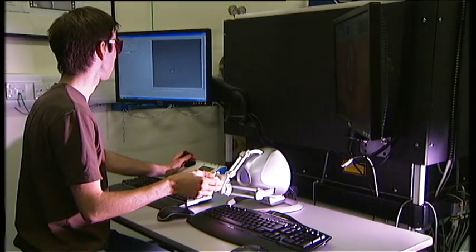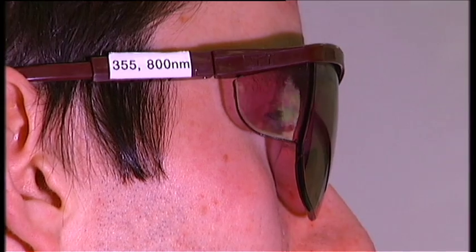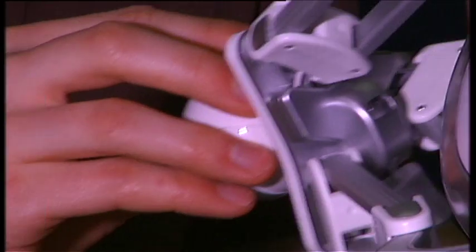In one form, we use an interactive joystick where not only can the operator move the object around, but they actually get to feel the force back on their control.